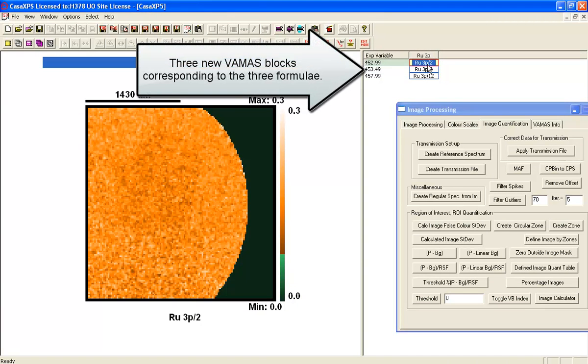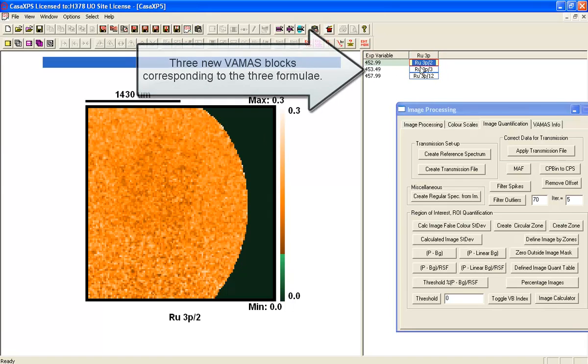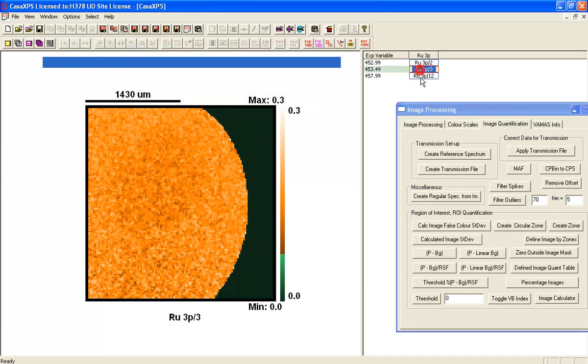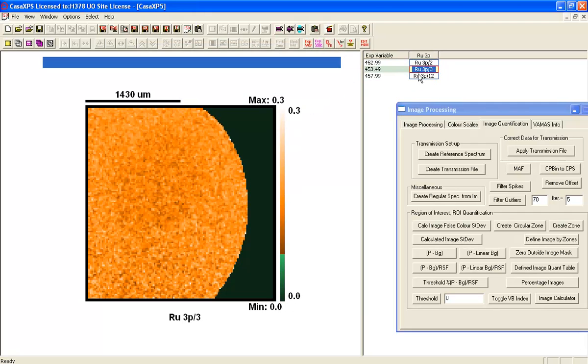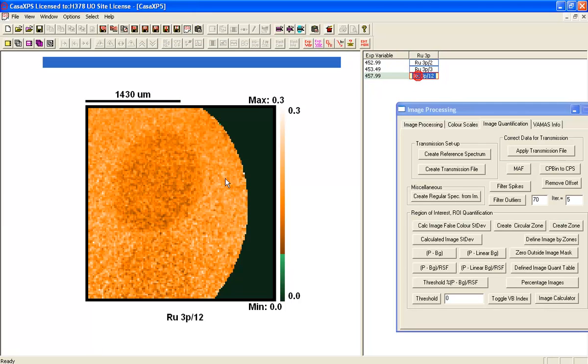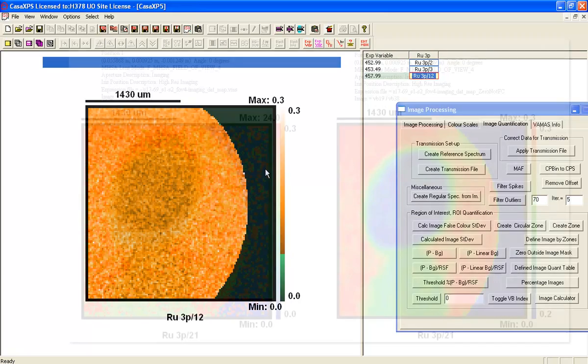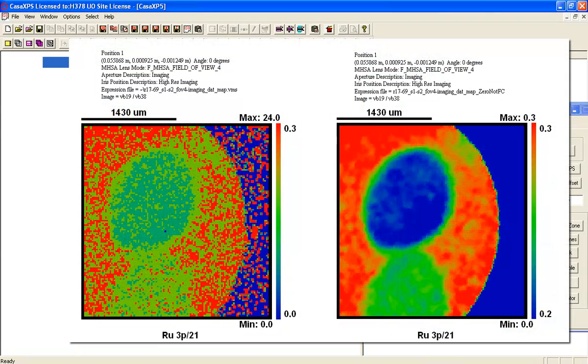So we now get images that have been calculated from these masked images and they allow us to have a well-defined view of the signal since none of the masked area can produce any anomalous intensities by dividing by very small numbers.